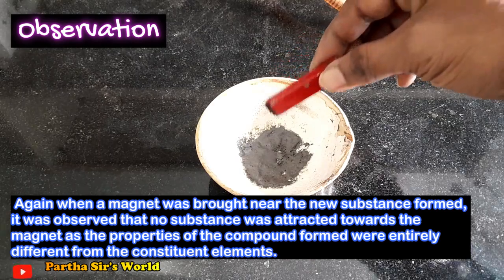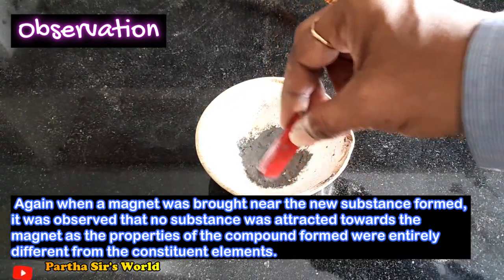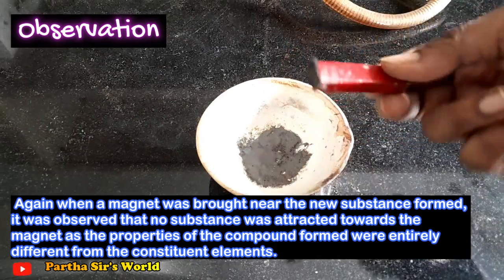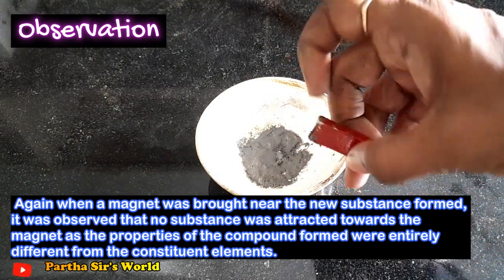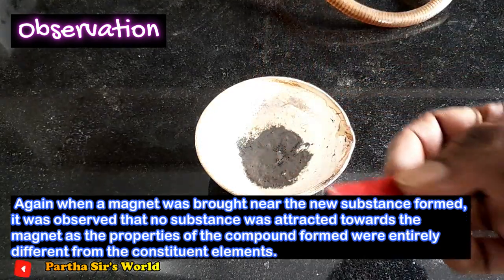Again, when a magnet was brought near the new substance formed, it was observed that no substance was attracted towards the magnet, as the properties of the compound formed were entirely different from the constituent elements.